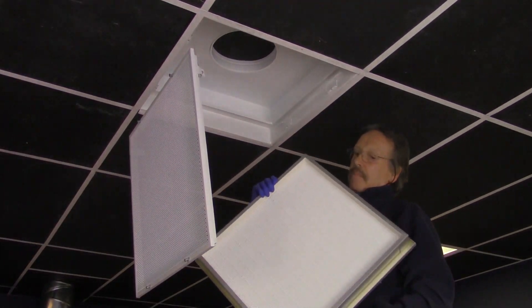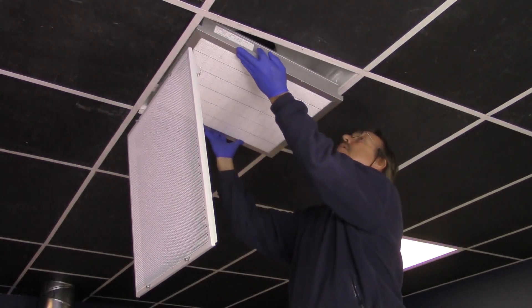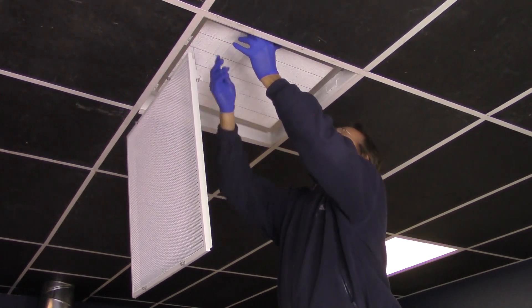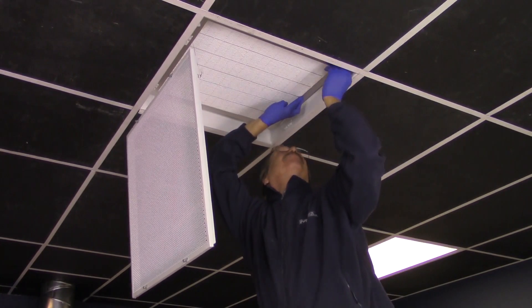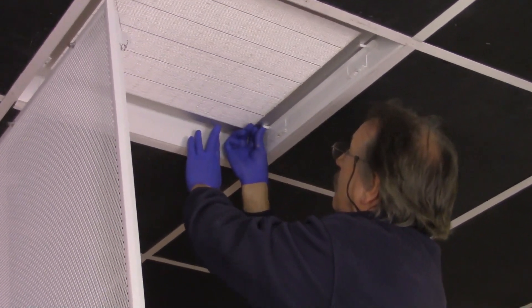Step 4. With the gel seal track facing upward, slowly push the HEPA filter up into the HPL-GS unit. Step 5. With the HEPA filter inserted, turn each of the four retaining clips 90 degrees to support the filter from underneath, securing it in place.